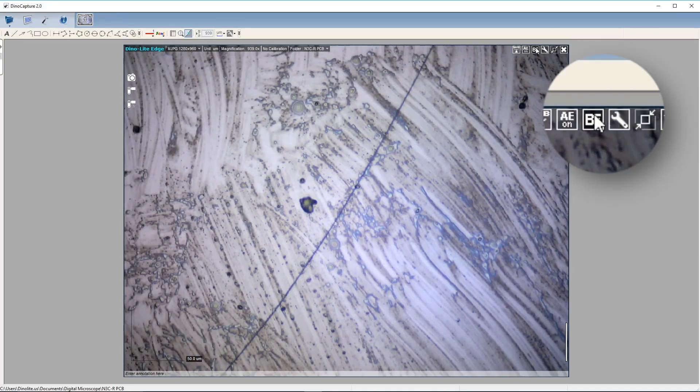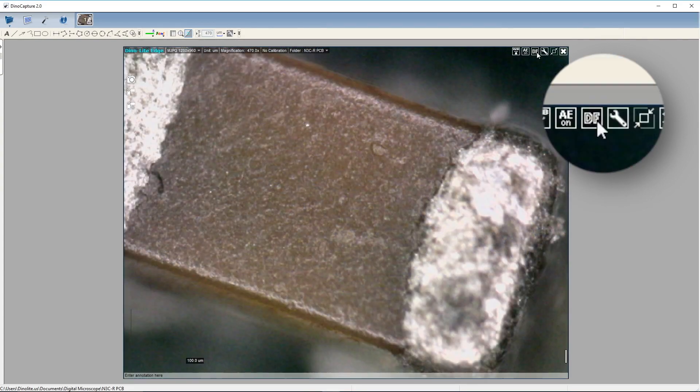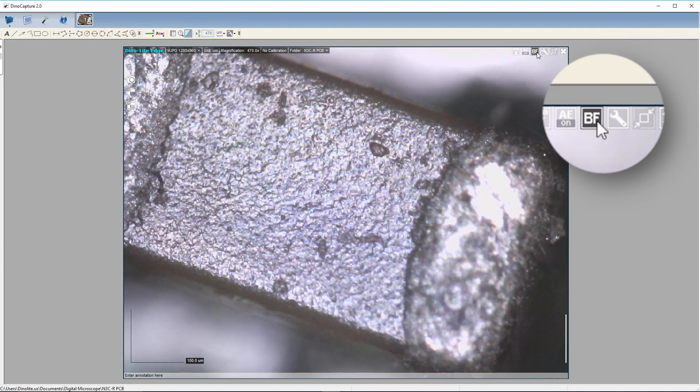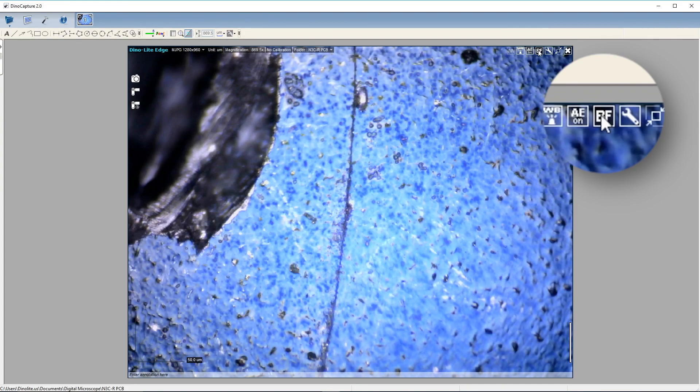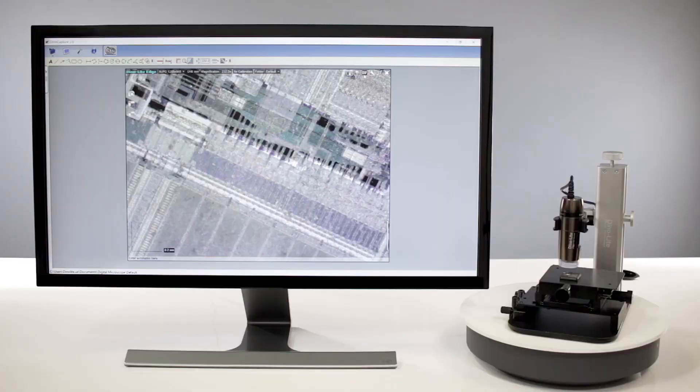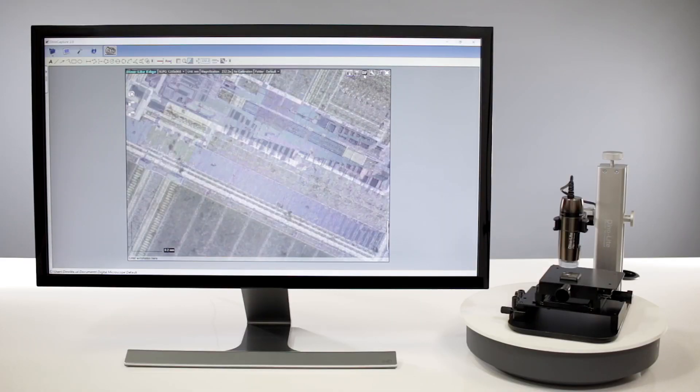Through the flexible LED control, users are able to switch between bright-field or dark-field modes, revealing more details than with any standard light source.